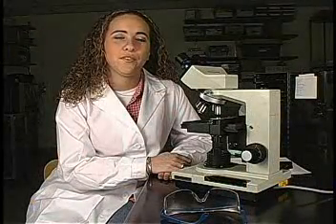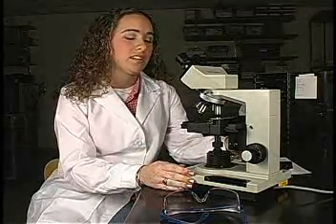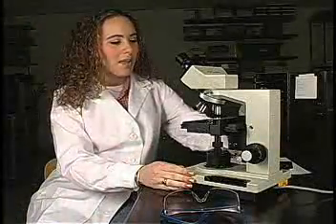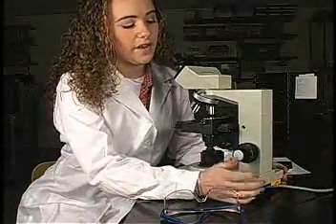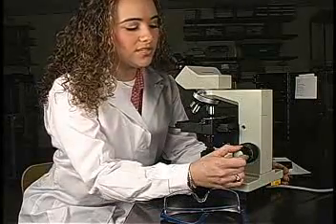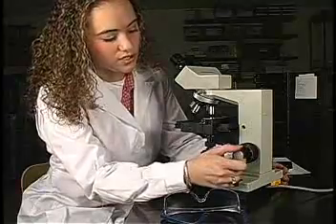Before we begin, there are a few things to take notice of on your microscope. First, you want to make sure that the condenser knob is turned all the way up. Be sure not to confuse this knob with the focus knobs. You want to make sure that your fine focus is in mid-range. You can do this by lining up the white line with the edge of the coarse focus.